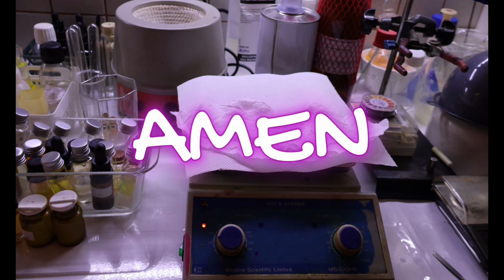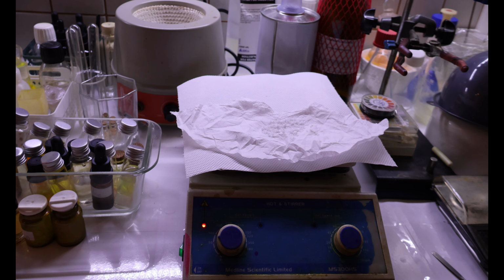Do I have a melting point temperature device? No, I do not. Do I have NMR? No, I do not have. Do I have mass spectrometry to do? No, I do not. Do I have HPLC? No, I do not.